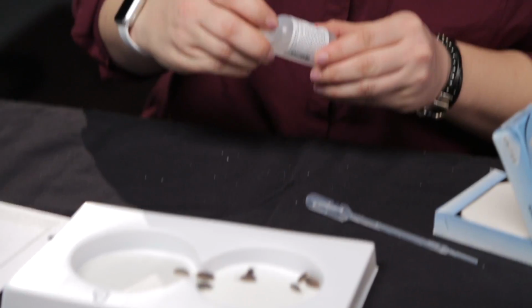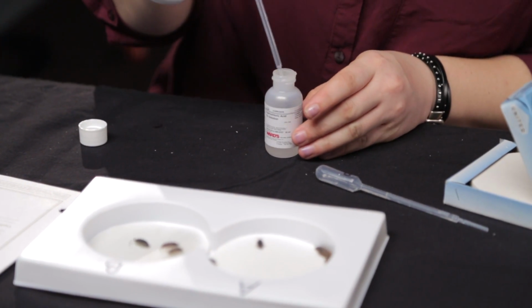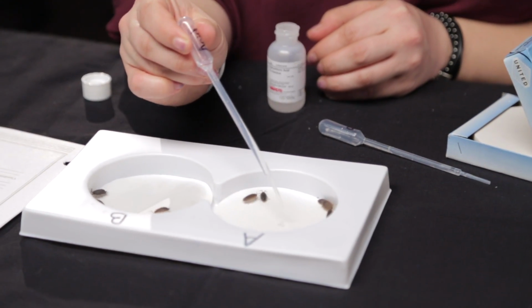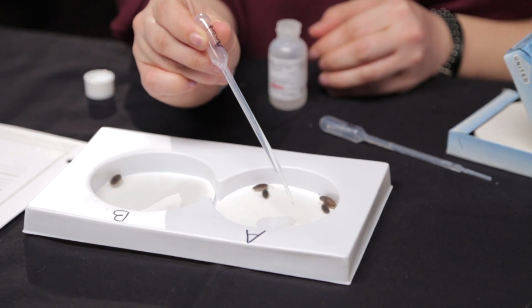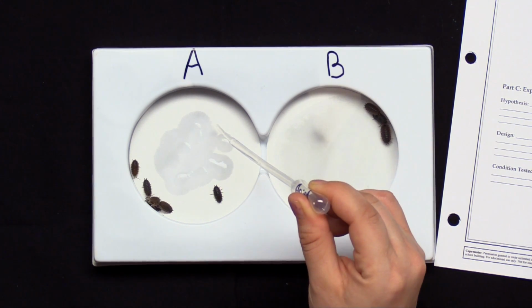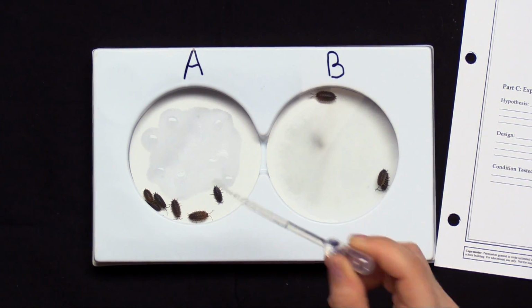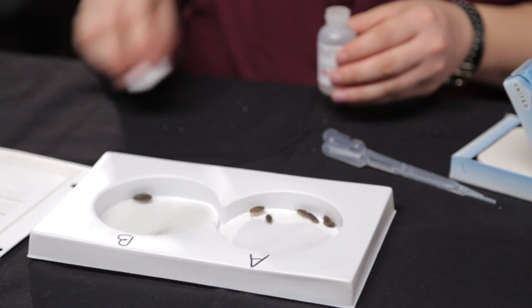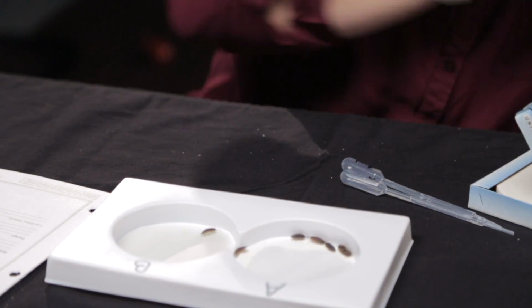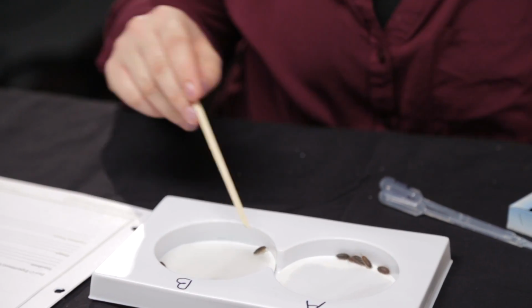My acid here is going to be hydrochloric acid. And again, it's a fairly weak acid. Acids you might be more familiar with are things like lemon juice or cola or tea. Generally, things that are acid taste sour. So I will wet the filter paper with that acid. And I think I got some under the paper, so I'm going to try to coax them out from under the paper. No, don't go under.